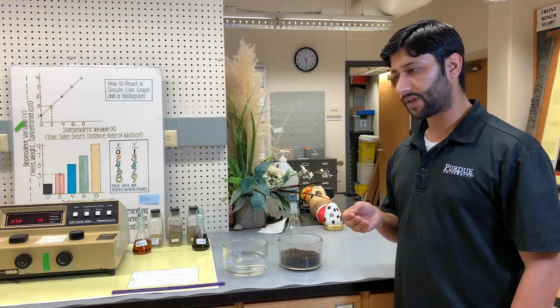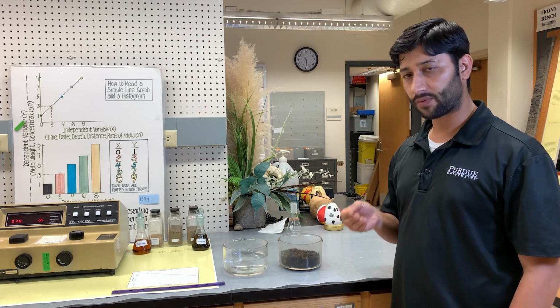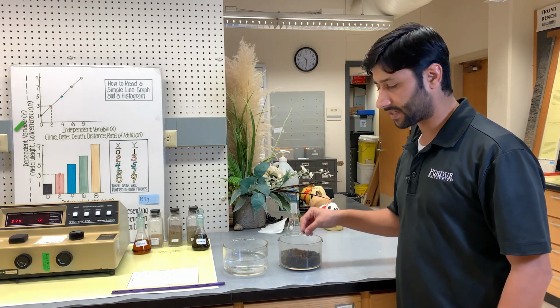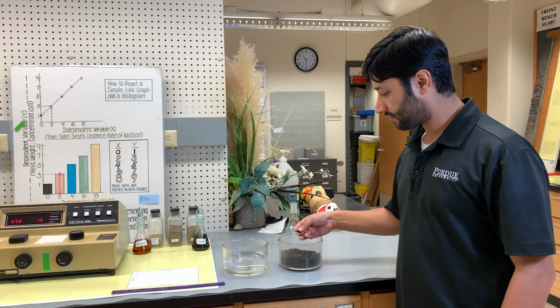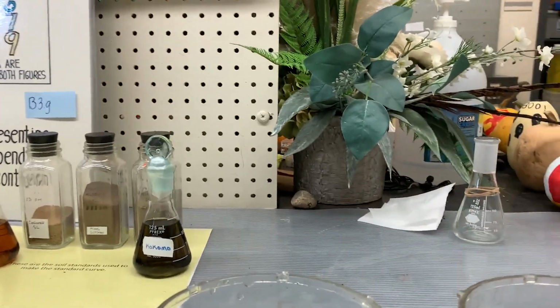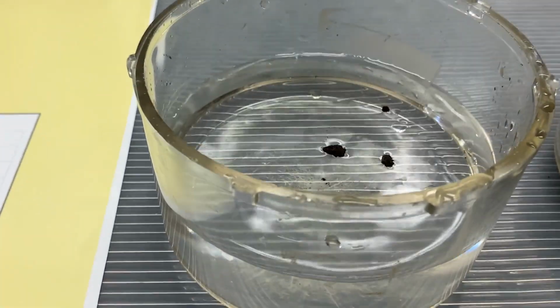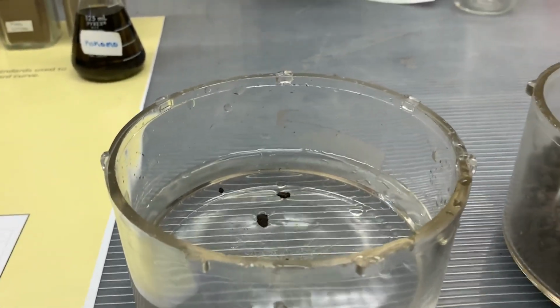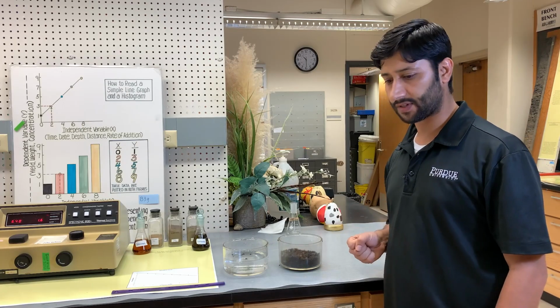One way to show you that organic matter has a bulk density of less than 1 is through this demonstration. We have water, which has a bulk density of 1, so the peat should be floating on top of it on the surface. It doesn't get merged into the water because it has a density of less than 1, which is the density of the water.